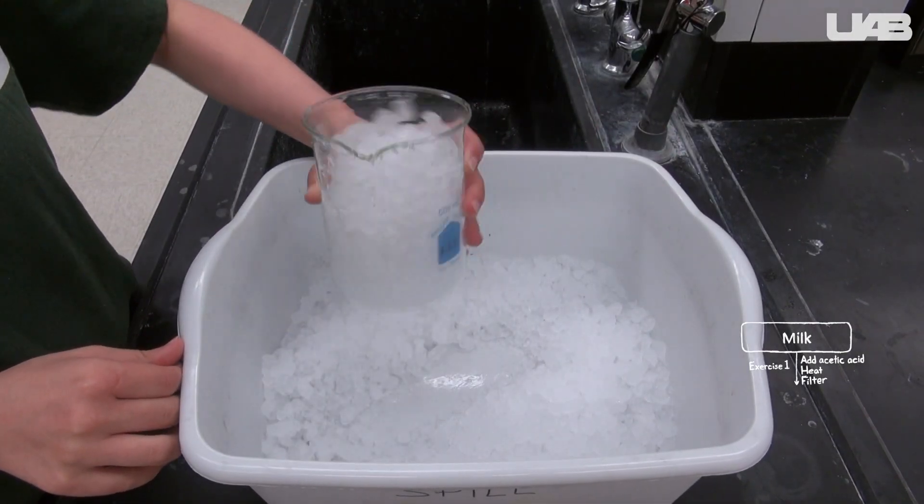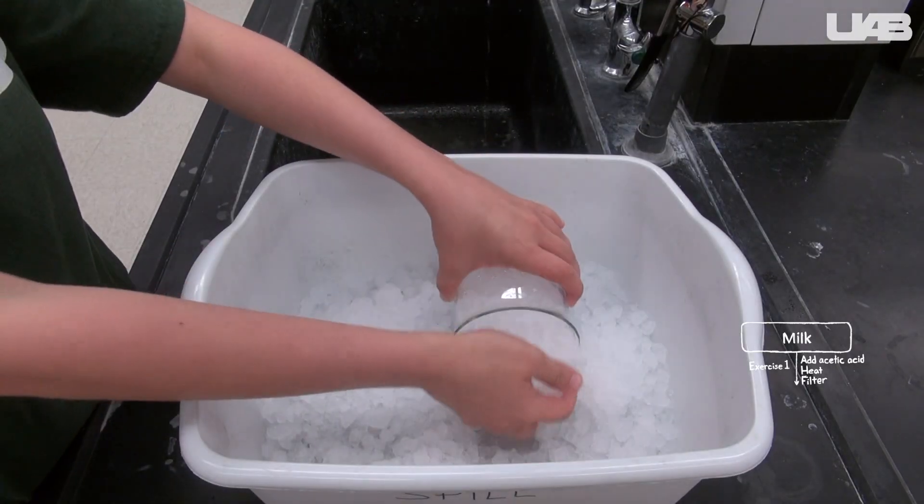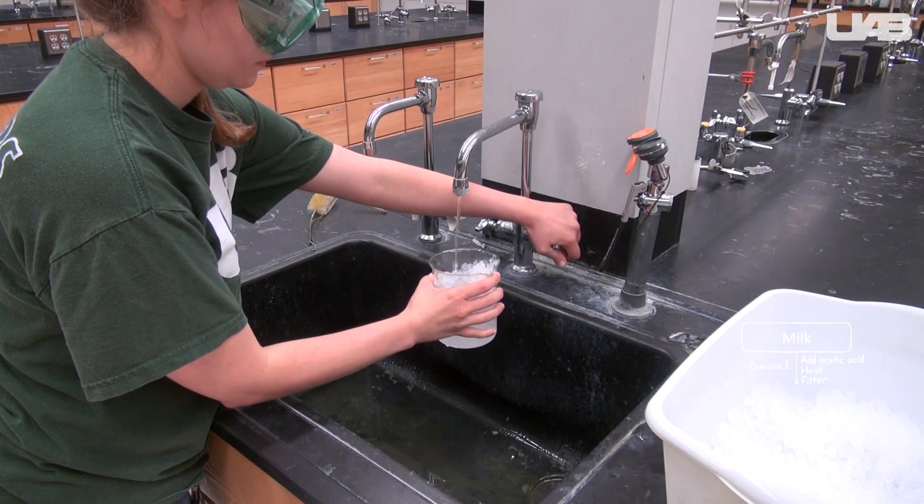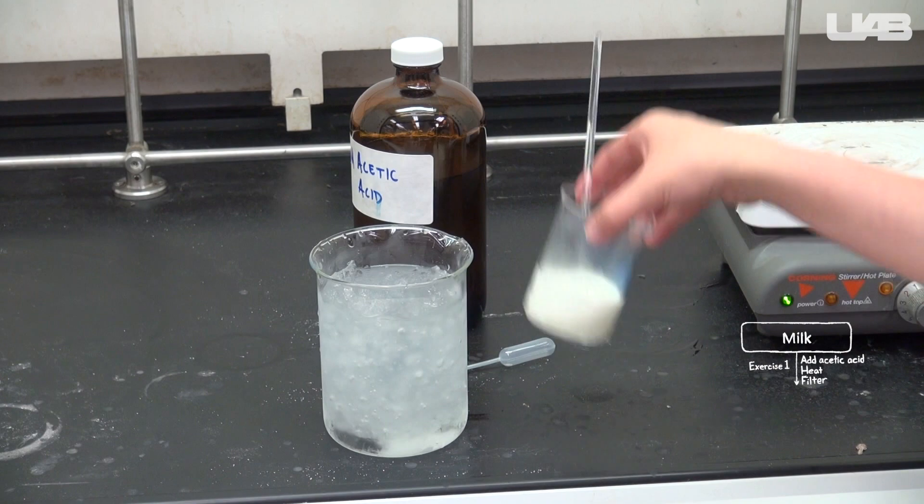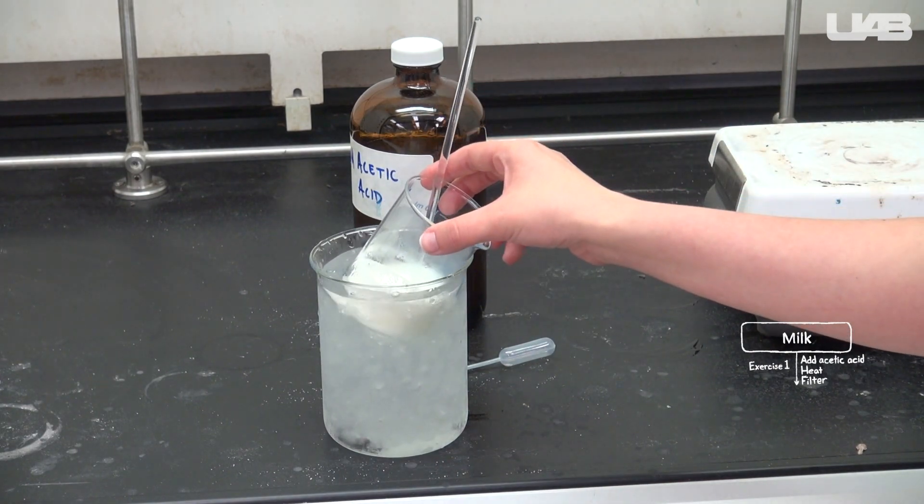Another member of the group should prepare an ice bath by packing a large beaker with ice and pouring some water into it. When the precipitate is formed, place the beaker into the ice bath.